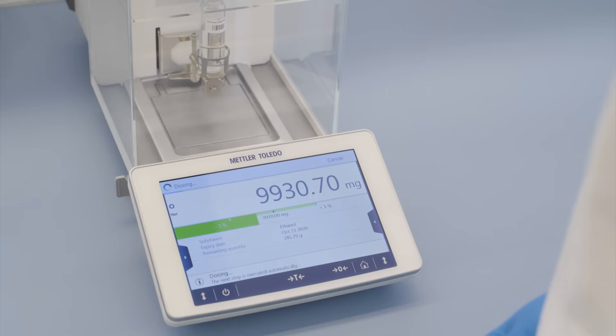In the background, LabX handles all your data and calculations automatically, ensuring full traceability.